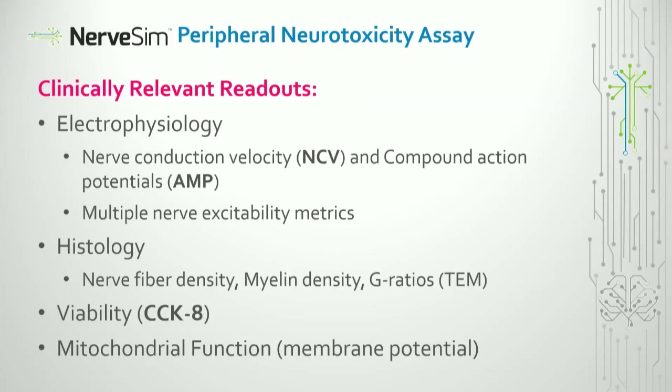I mentioned some of these readouts, and I'm going to briefly touch on a few of these points here, but we have another talk tomorrow that Lowry Curley, our CEO, will be giving on a specific case study, and then Corey Roundtree, our lead scientist, will be talking about a project he led on really scaling this platform up, which is quite relevant to the discussion that we were just having next door, too. There are a number of different endpoints we can do to be able to multiplex these as well, which is extremely important, of course.